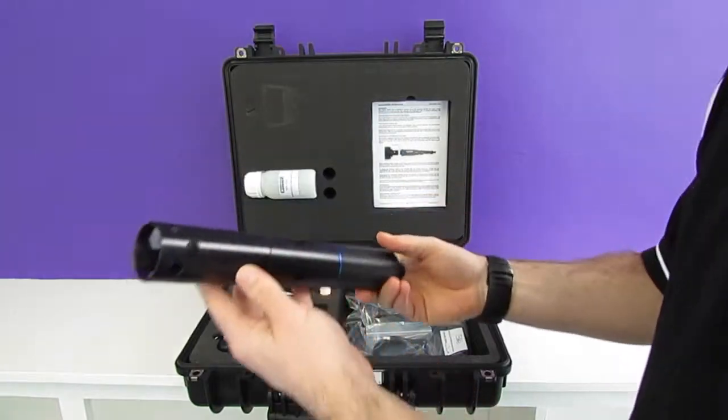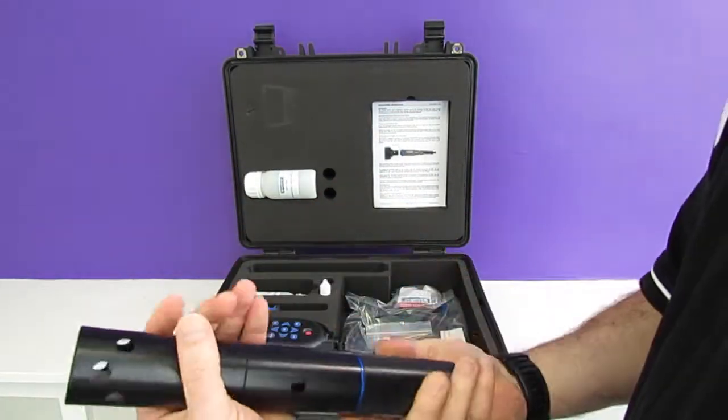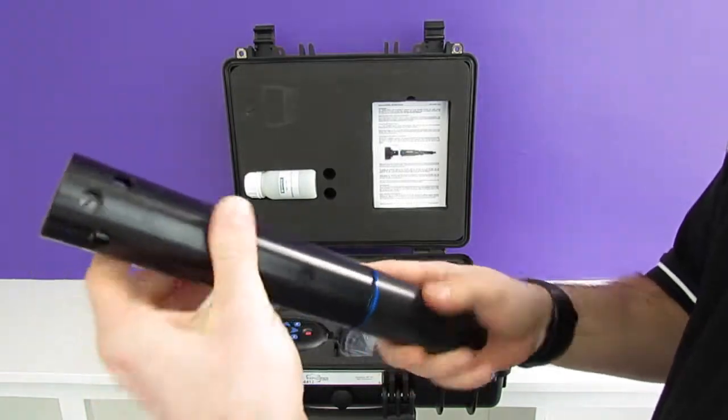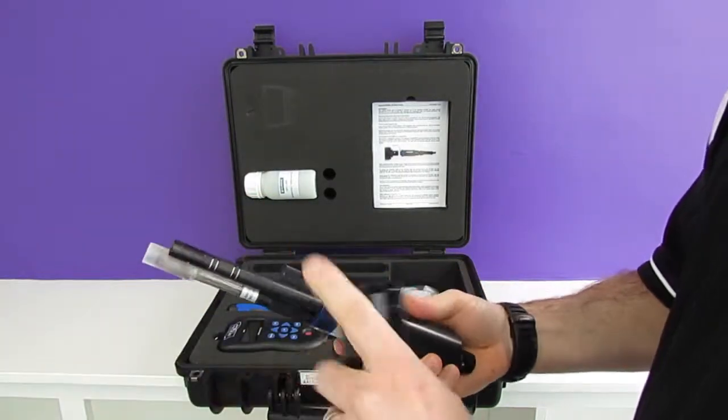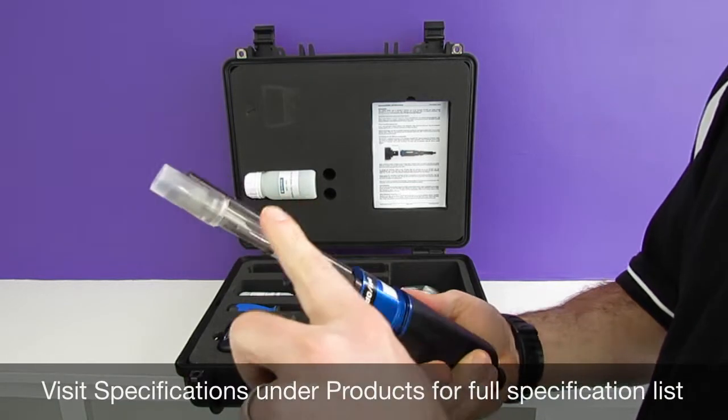Secondly we have the AP2000 aqua probe complete with the metal aquacon connectors. Let's just take the sleeve off and take a look at this probe. So we have our conductivity, optical dissolved oxygen, and pH/ORP.